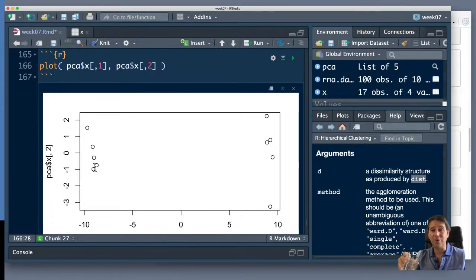Rather than viewing all the genes and all the samples in some crazy way, do a quick PCA analysis, as we've just done, and look at the results. Is the wild type consistently different from the knockout? Or are the drug treated and the controls clearly different in this kind of analysis? If they are, happy days. We're good to continue, right, and dig into why they're different and go into the biology of these things. But if they're not, or if there's some outlier or something that's causing a problem or driving all the variance in this data set, then we probably need to pay attention to that first. Okay, but here let's make sure that this is the case.